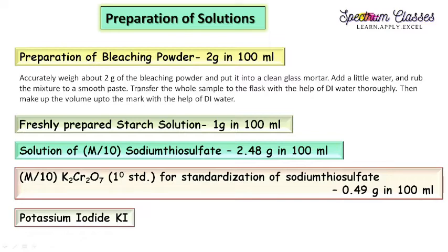For preparation of the bleaching powder solution: accurately weigh 2 grams of bleaching powder in a clean glass mortar and pestle, add a small amount of deionized water, and make a smooth paste. Transfer that smooth paste to a 100 ml measuring flask with deionized water, making sure all the bleaching powder paste is transferred completely. Then make up the solution to the 100 ml mark with deionized water.